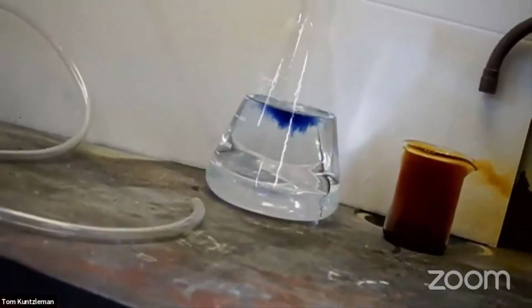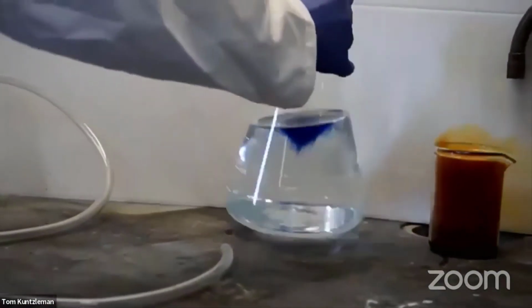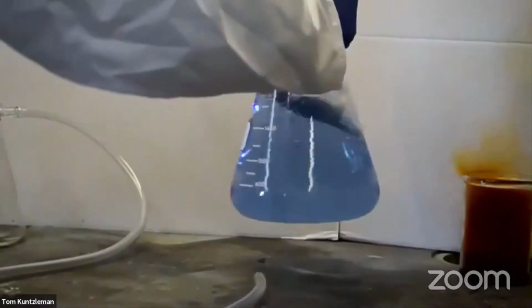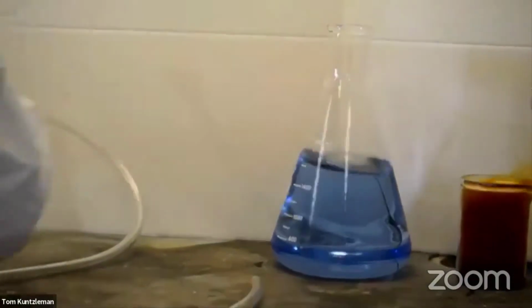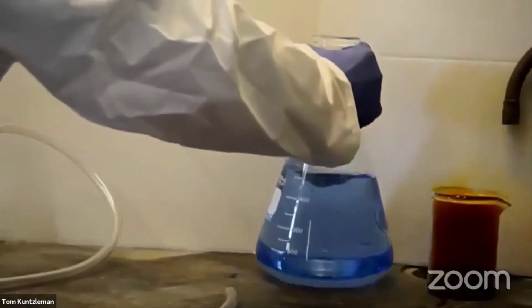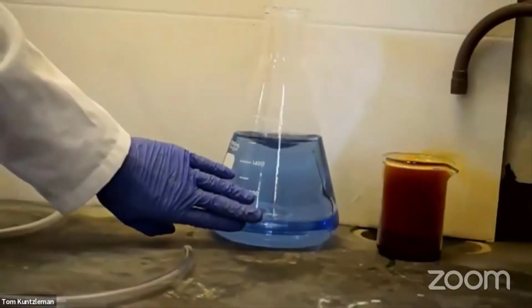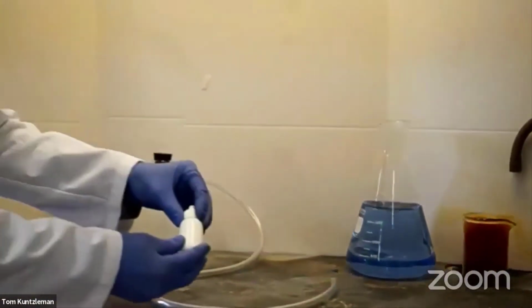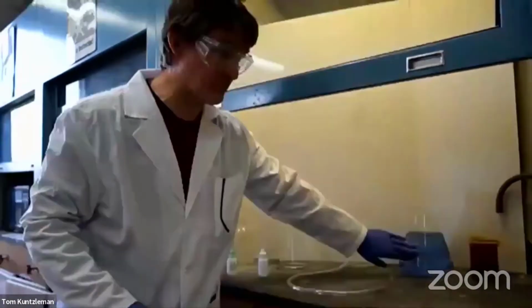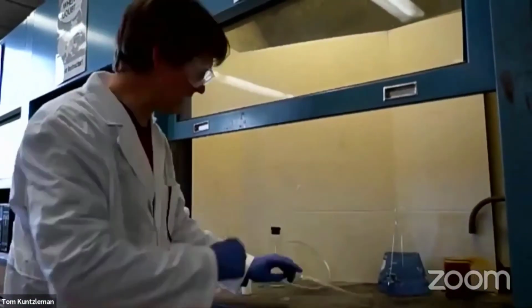Oh, I see some blue color developing. That's because I added some base to this. I'm not sure I'm going to add more. I don't want to put too much in. But sure enough, we know I added a base to this, and plus, we've added the acid-base indicator, and this has turned blue. All right, remember, it's colorless in an acid.